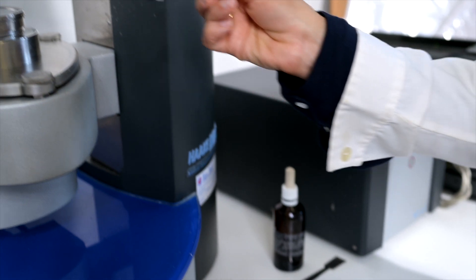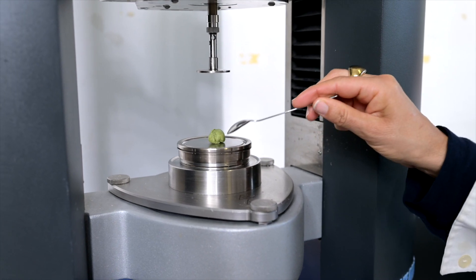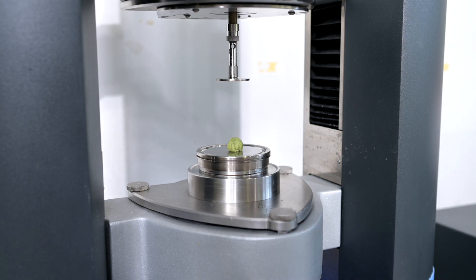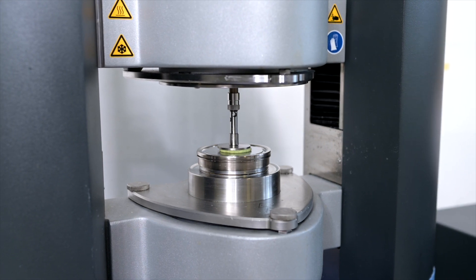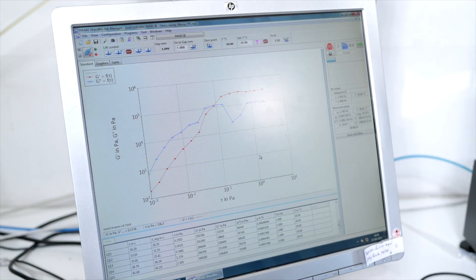Here we are measuring G' and G'', which are the important rheological parameters. We are going to observe the linear viscoelastic region for this type of dough. With this test we can observe the magnitude of the stress that can be applied for each dough, which is really important for the next steps of the rheological measurements.